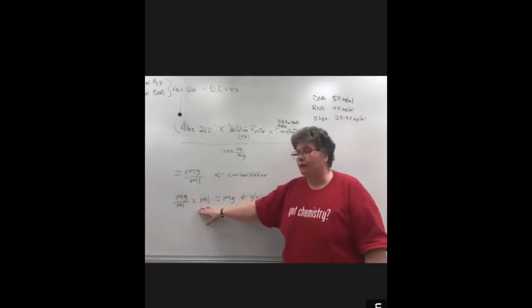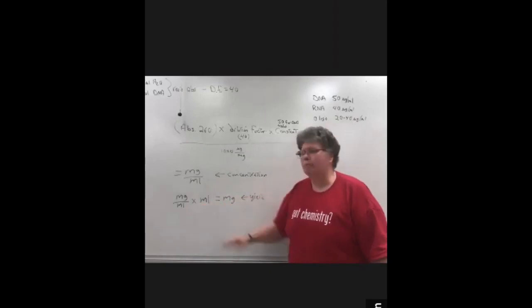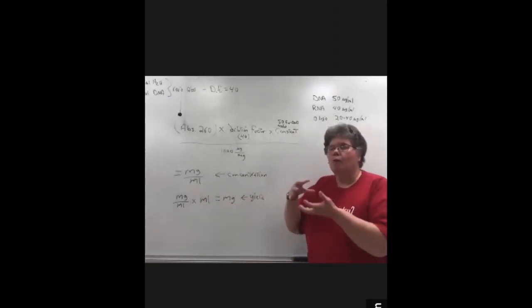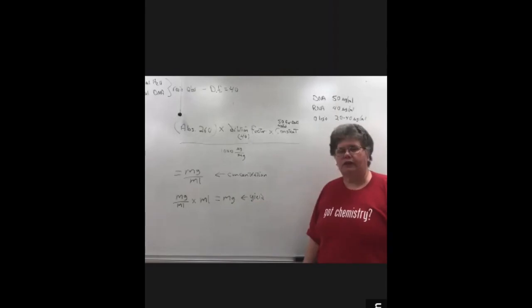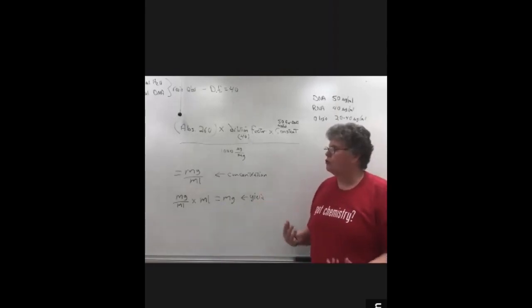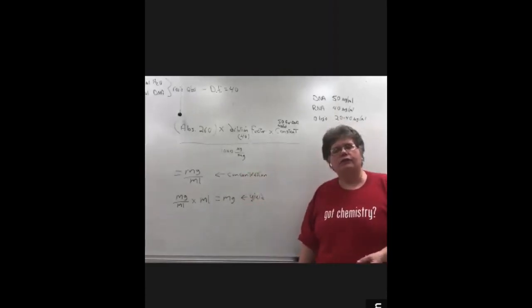Now remember, you don't always have to bring it up in 1 mL. As I said in lab, we bring it up in 0.5 mL. So in that case, this number would be 0.5 instead of 1. So that's why you always have to remember what volume you brought your DNA up in to dissolve it, so that you can accurately calculate your yield. So for your report, you're generally going to be asked to evaluate the purity, the concentration, and the yield on your DNA.